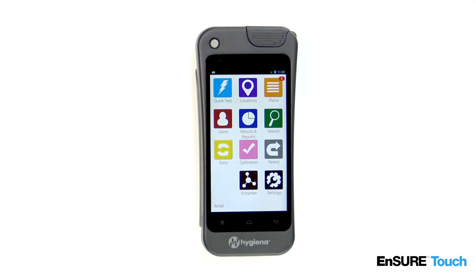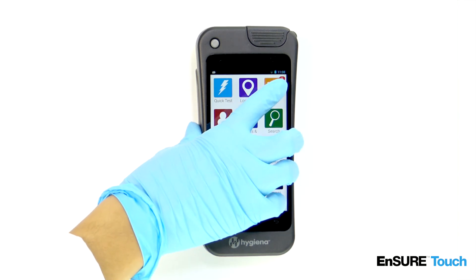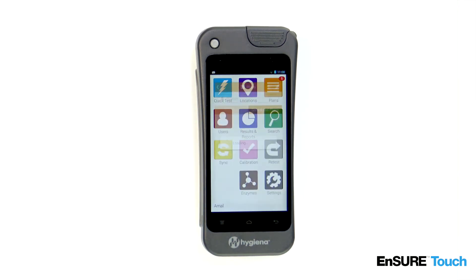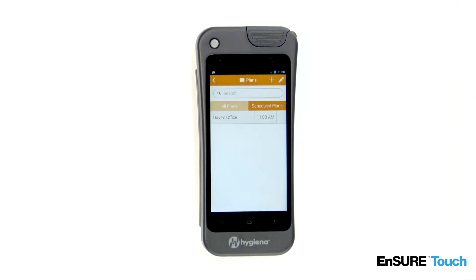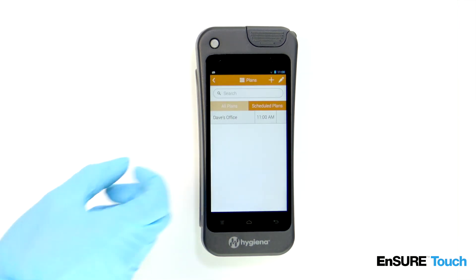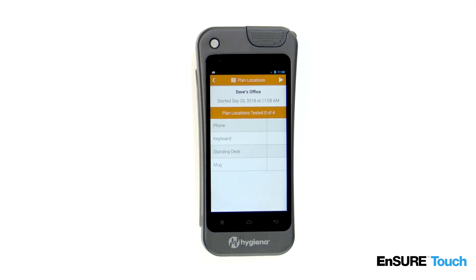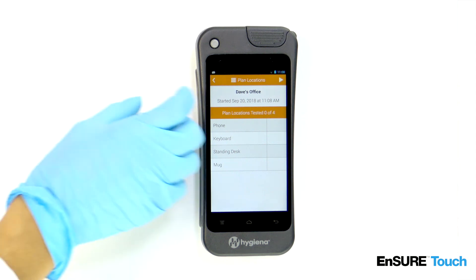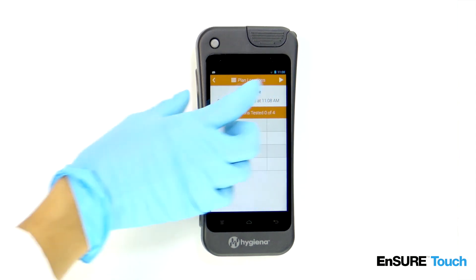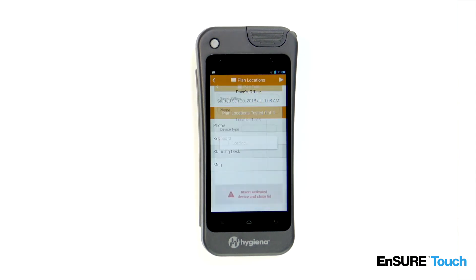When it's time to start testing, simply touch the plans icon. Touch the name of the plan that you wish to run. From here, you'll see the location names in the plan. If these are the locations you'd like to test, touch the play icon to begin testing.